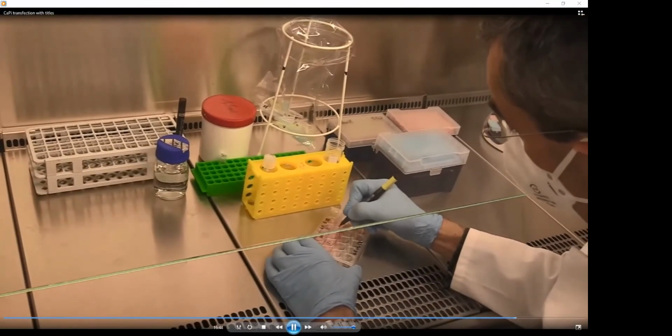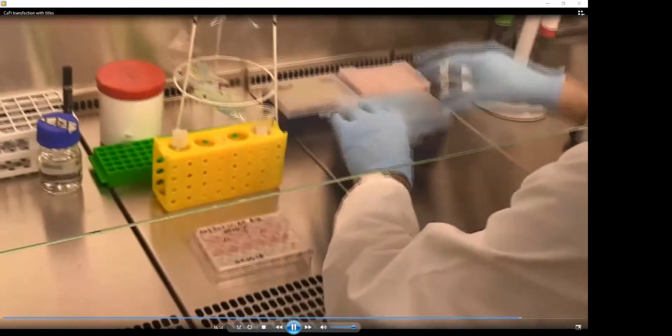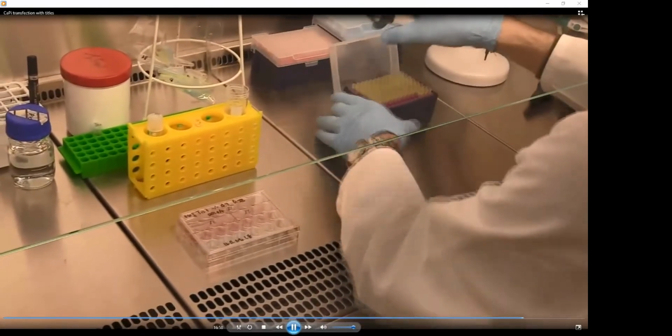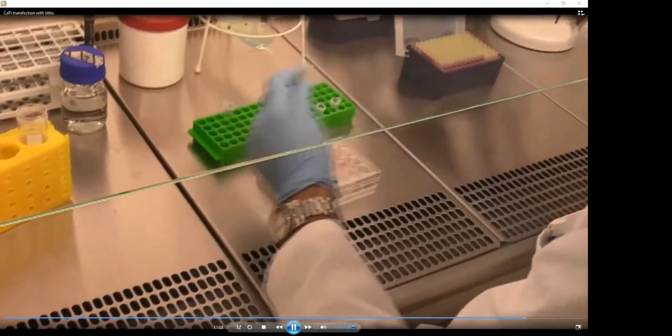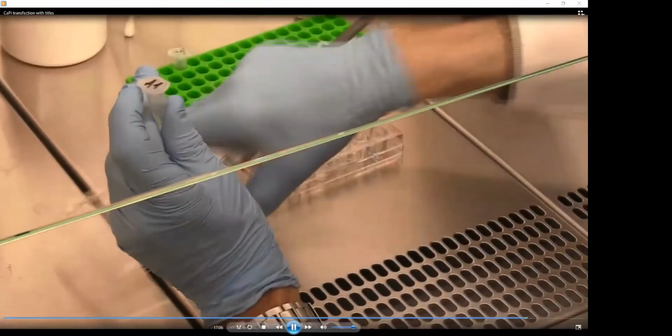Then it's important to label it properly. So this is a very important step. Don't forget to do it when you do the experiment yourself. As you see on the top, we have B1, 2 times 3 samples, because one will then be treated with lithium chloride, the inducer of Wnt signaling. And then we have samples B2 and B3.